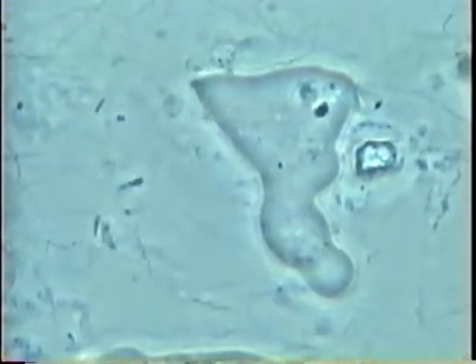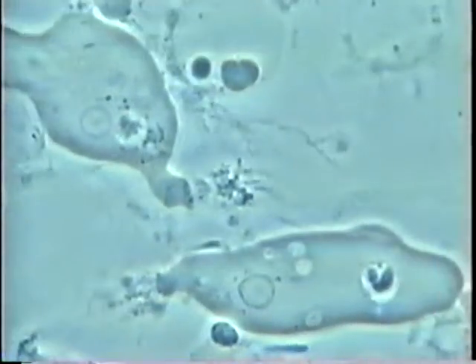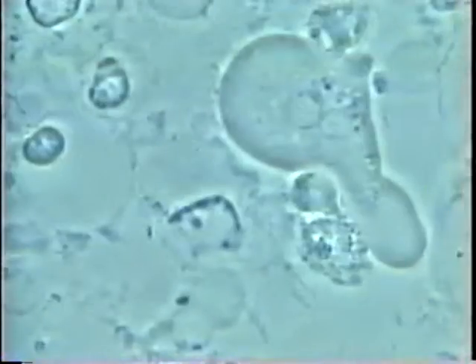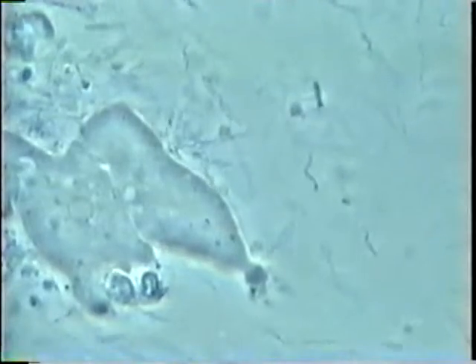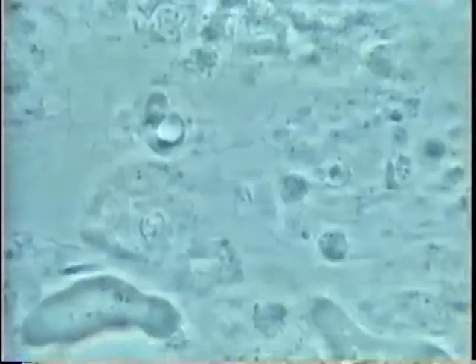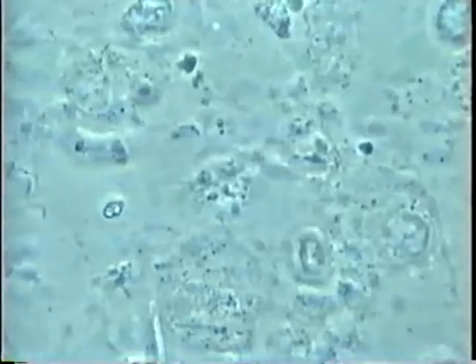You can see how it is really like a larva walking into the gum — very impressive. The uroid is visible here at the end of the amoeba. Bacteria, spirochetes, and amoeba again, with many nuclei inside, showing how reactive and active they are in the biofilm. The uroid again at the end of the amoeba, with little baby ones here. This is very incompatible with health, so get rid of this biofilm.